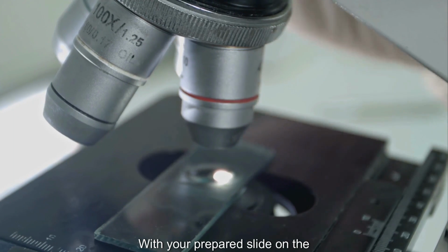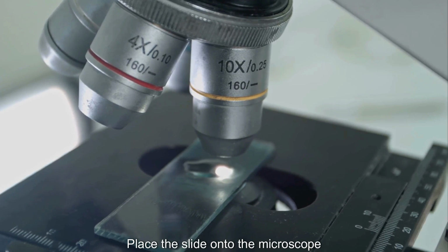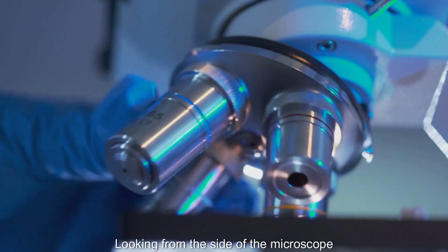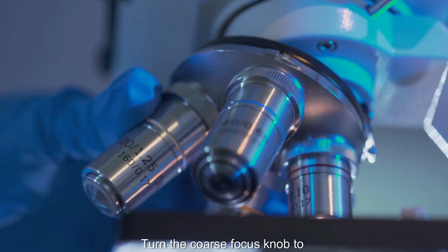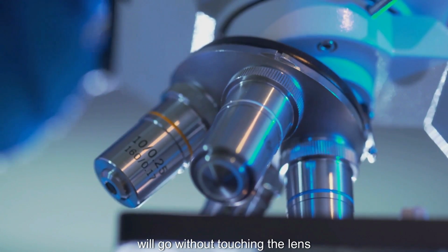With your prepared slide on the table, the hunt can begin. Place the slide onto the microscope stage and secure it with the stage clips. Looking from the side of the microscope, turn the coarse focus knob to raise the stage as high as it will go without touching the lens.